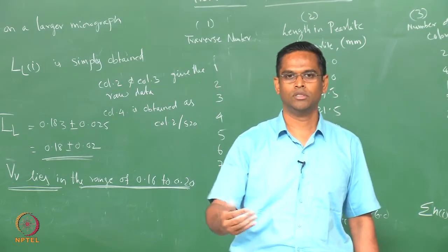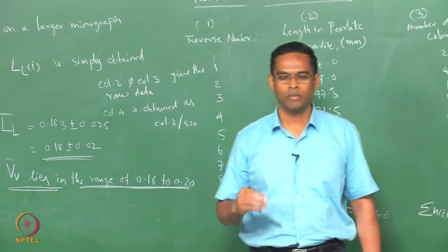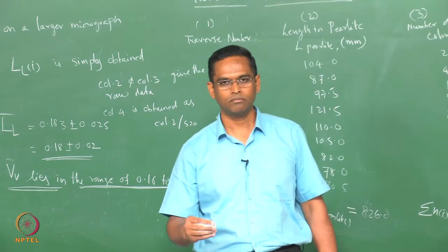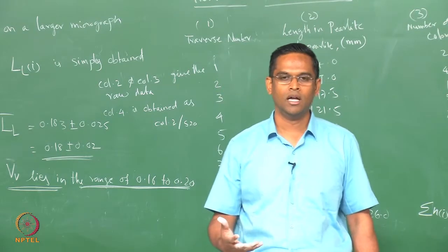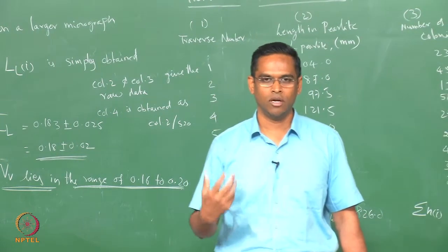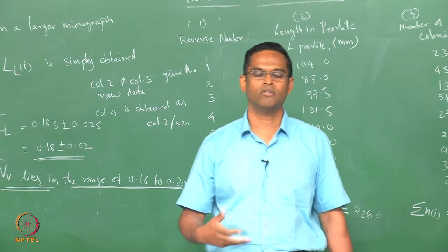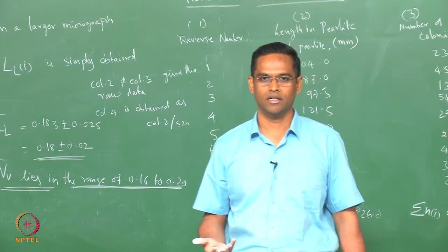You should also make sure that the sampling is random, and maximize the number of measurements, then your values will be close to reality, or representative of the microstructure you are interested in.